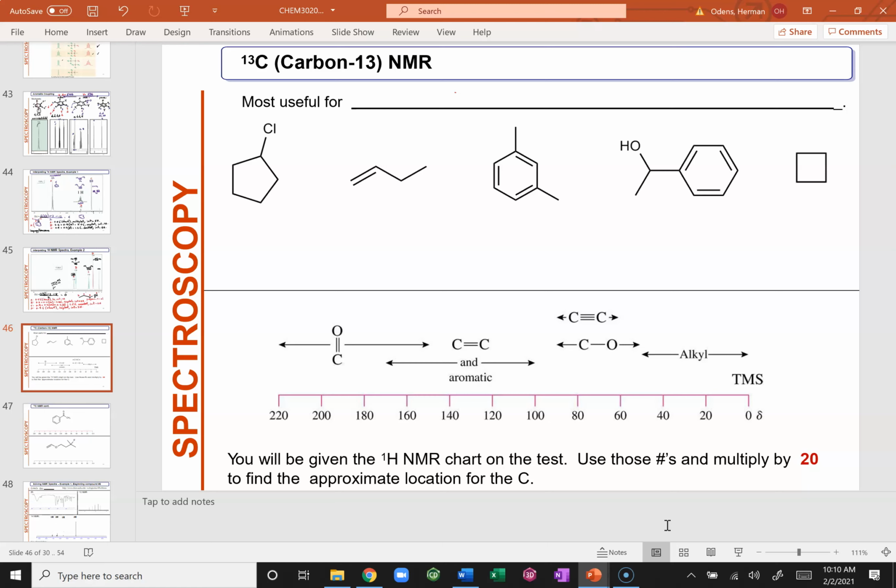Carbon-13 NMR is an isotope of carbon-12, just like deuterium is an isotope for protons. And so you can use it to determine the types of carbon the molecule has. I'm going to put types in capitals. All right. So, how many types of carbons do you see on the first molecule? Before you think of it, think of symmetry first.